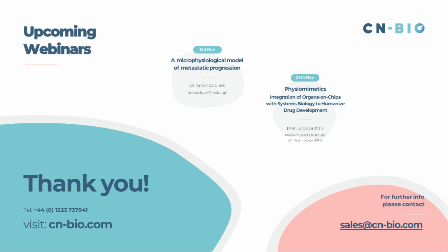Yeah, so we use a really wide range of endpoints to understand and detect DILI in the system. So we typically don't just use standard sort of ATP readouts that you might do in more simple systems. And one of the main reasons that we can detect a really wide range of endpoints, particularly clinically relevant endpoints, is for 2 reasons. A, we have quite a large number of hepatocytes in our system. So the standard scaffold has up to 600,000 hepatocytes in it in a single culture.